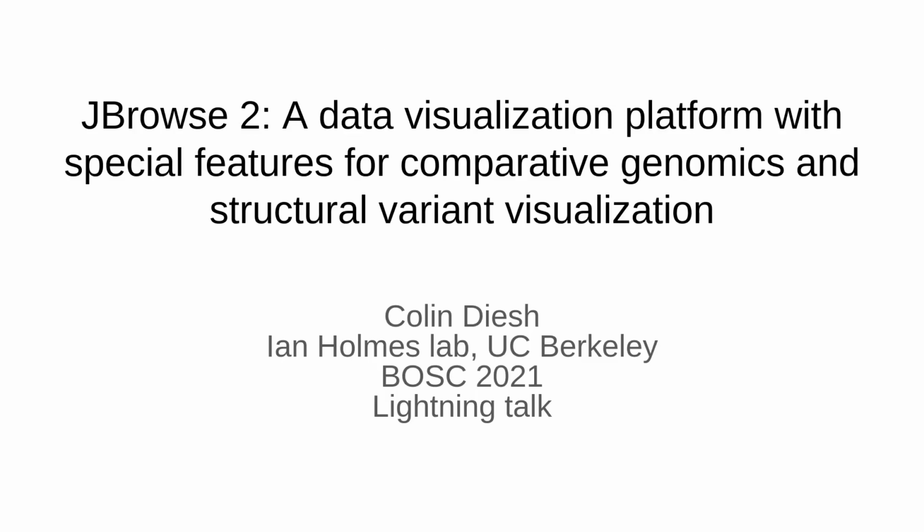Hello everyone. Today I'm going to be presenting JBrowse 2, a data visualization platform with special features for comparative genomics and structural variant visualization. This will be a lightning talk, so it'll move pretty quickly.